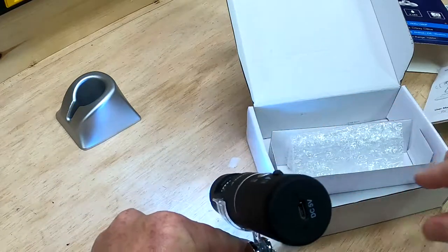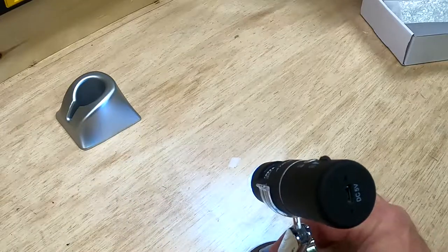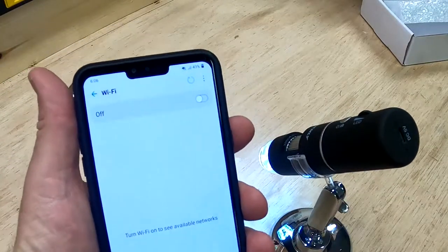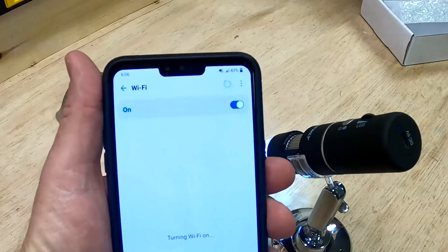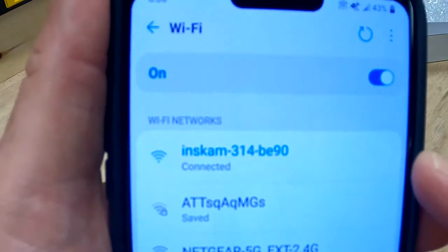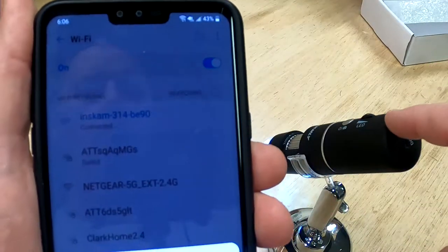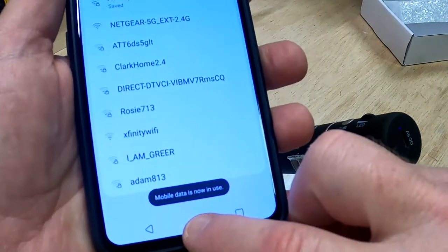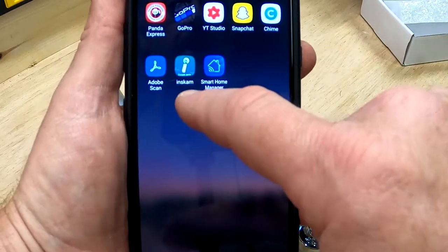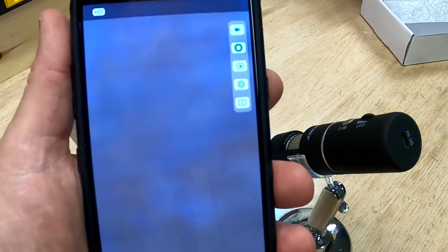This thing is Wi-Fi, so here's how that works. On my phone I turn on Wi-Fi and there's a signal called ISCAM 314 BE90 — you connect to that. You don't need a cable; your phone connects to the microscope over Wi-Fi. Then you download the ISCAM app, and it automatically works — it's really simple.